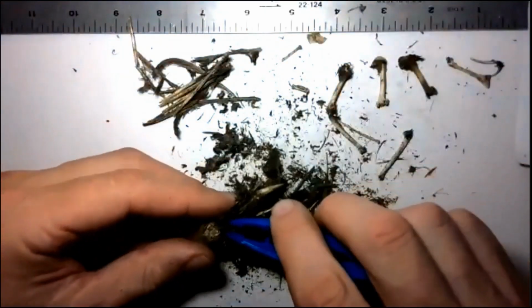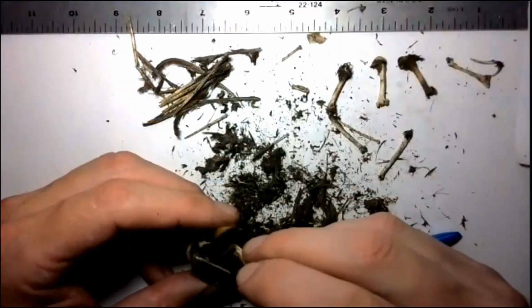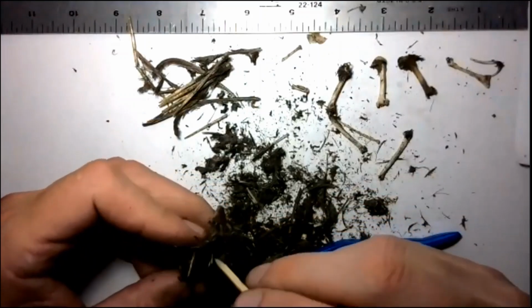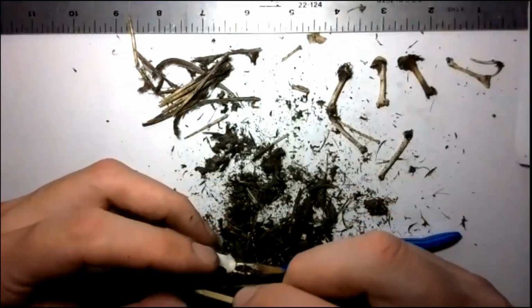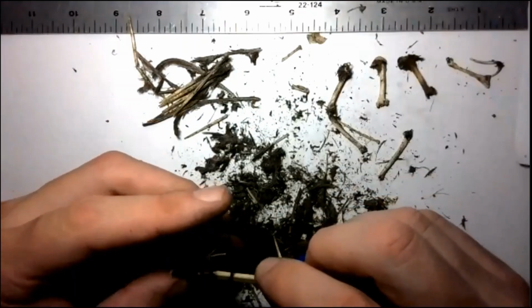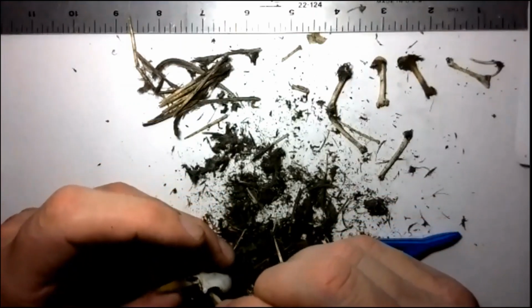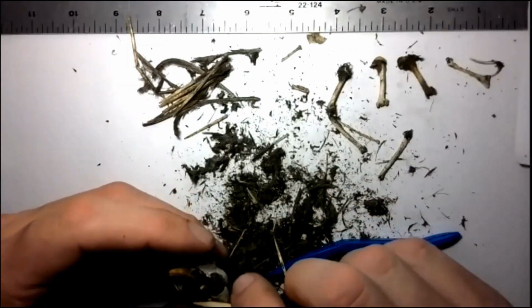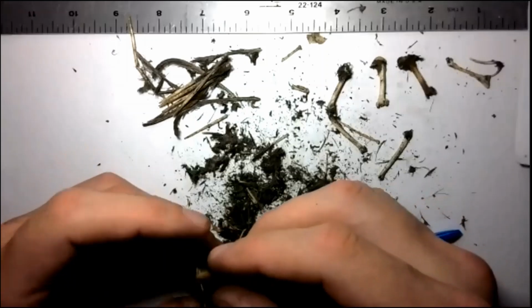What else is in here? Sometimes I use this to poke more fibers, feathers. The skull is emerging. Look at this beautiful bird skull. I think I'm gonna keep this one. Okay, the eye sockets. And this is the jaw still attached here. Oh no, this is the keratin cover.